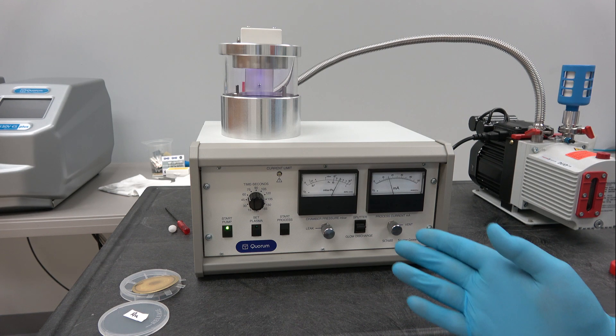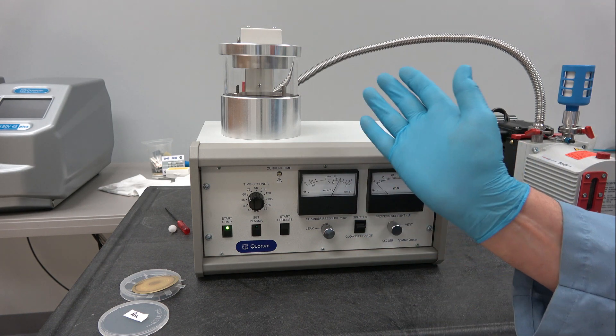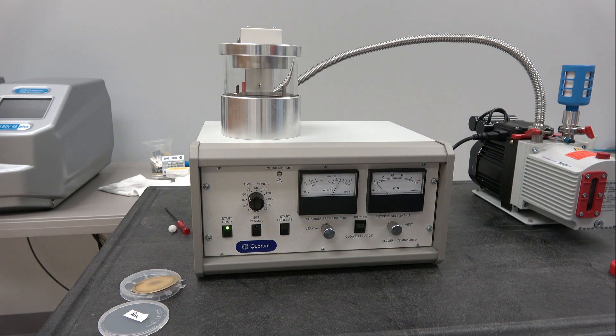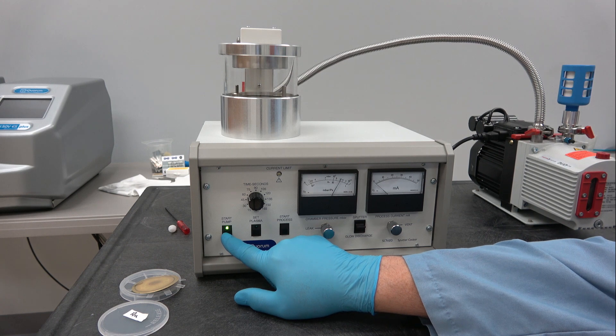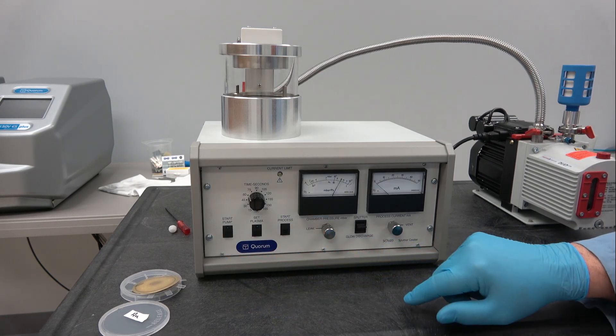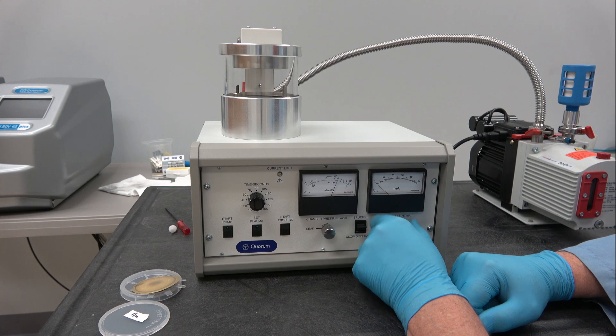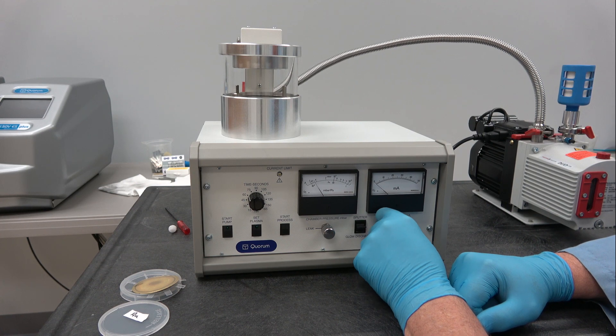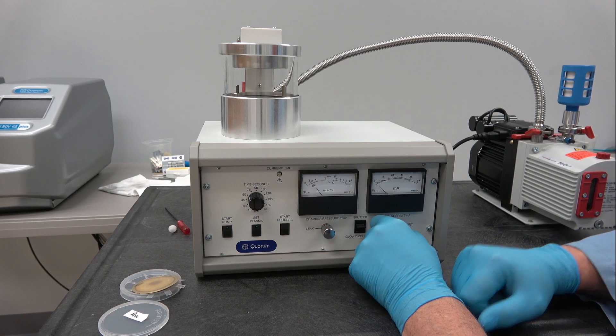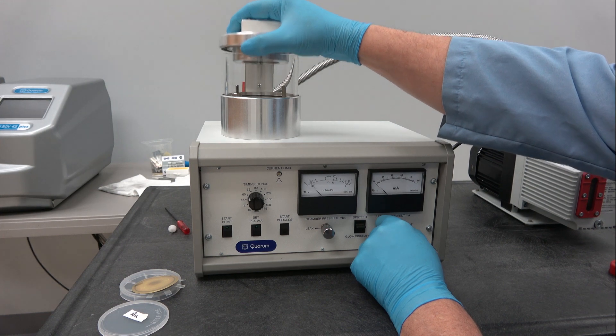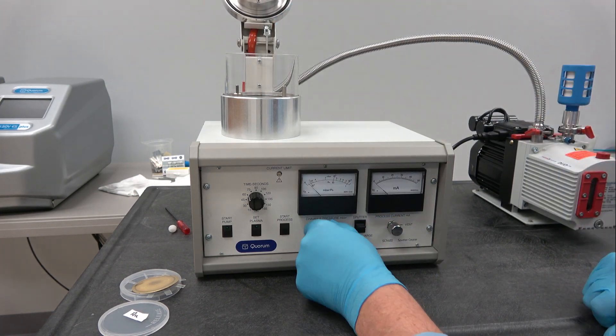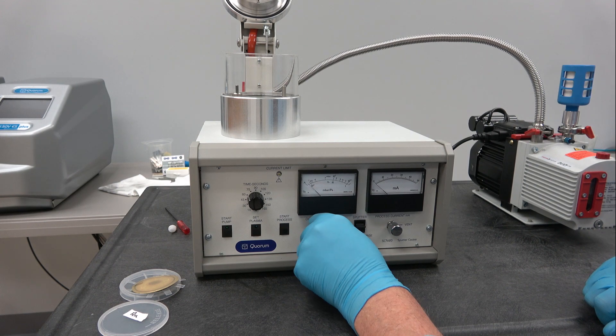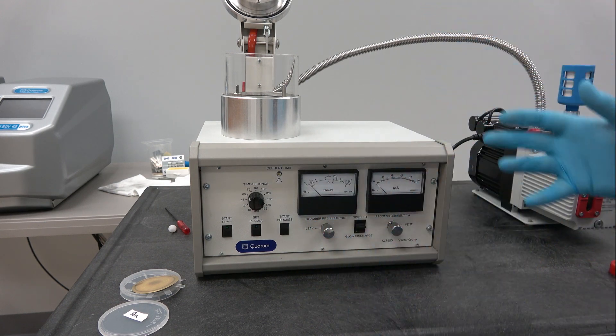So at the end of the time, the sputtering is terminated. And then you can press the start pump button and open the vent valve. Completely vent the chamber and it opens like that. Then you gently close the leak valve, take your samples out.